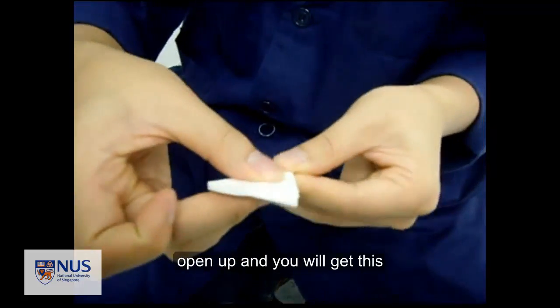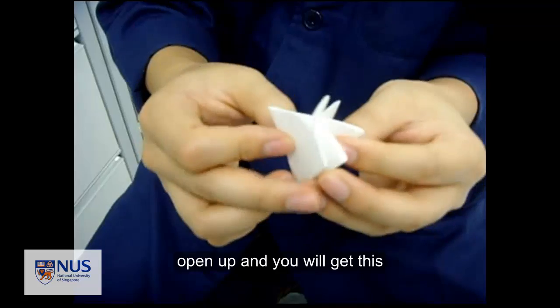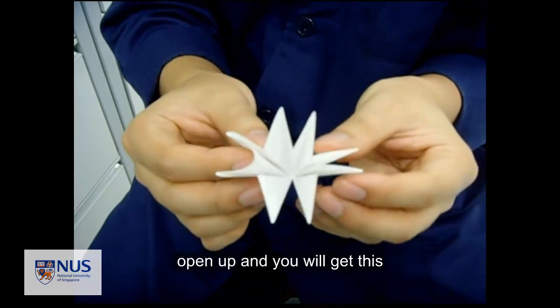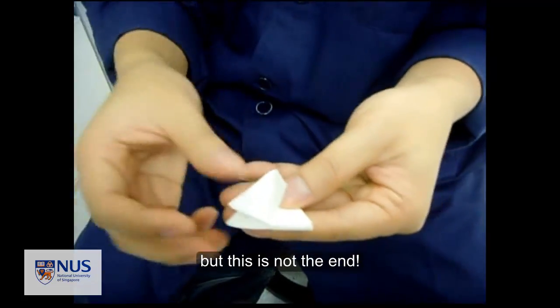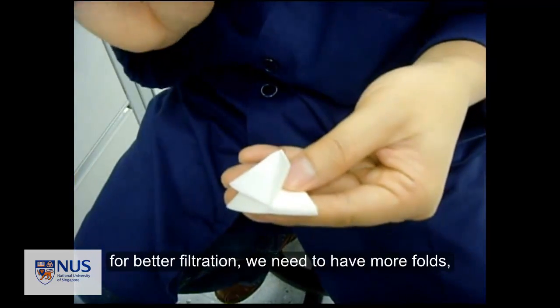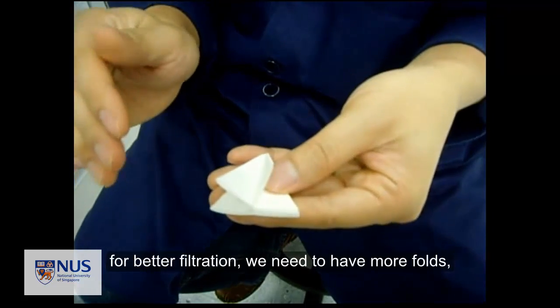With the last fold, you open it. It's not finished yet. For better filtration, you need to have more sides and more folds.